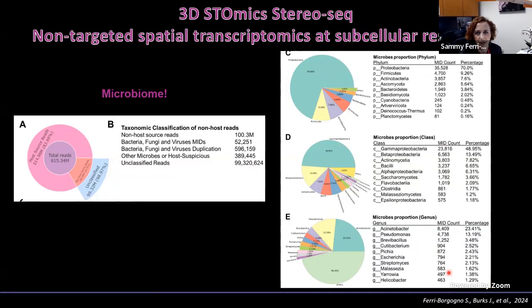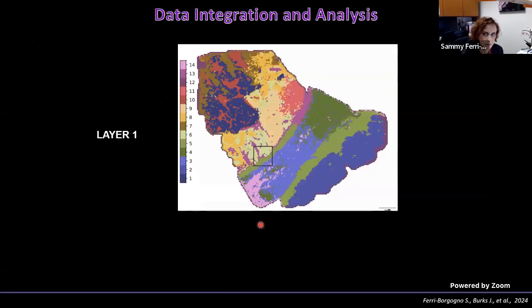So the data was very exciting, and we're now working to correlate these sequencing data with the spatial data that I showed you earlier in the gene expression profile, as well as the metabolites, which we think is the most intriguing and important correlation, because bacteria can really influence the metabolism and the metabolic profiles of the tumor immune microenvironment. So, just a few more quick details on the data analysis that we performed.